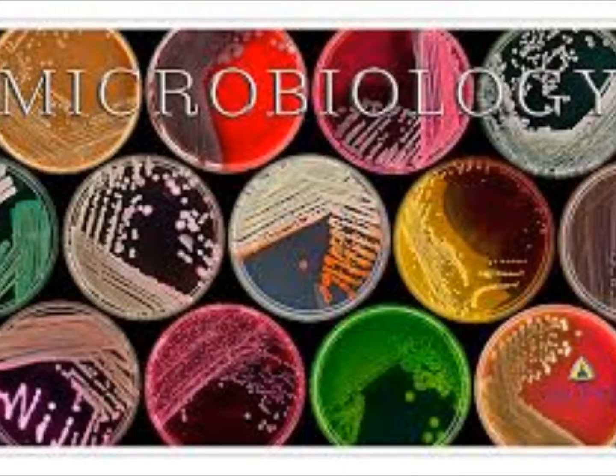All right, guys, real quick. Say I have organism number 1, and I look at my blood plate. I'm going to record the hemolysis, and since we are doing written recording and not computer, I'm going to use the Greek symbols. Remember, beta was the B-like, alpha was the sideways loop, gamma was the loop on the bottom. Say I have the Klebsiella, and I think it looks gamma, gray and large. Say today it's mucoid, so I will note that.